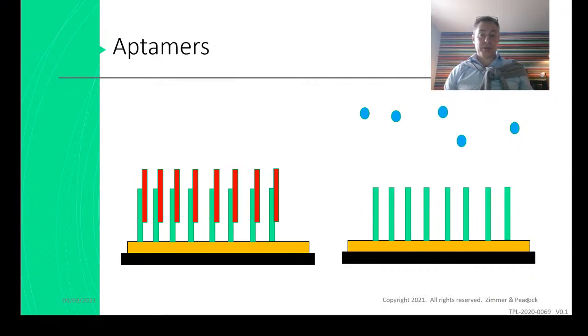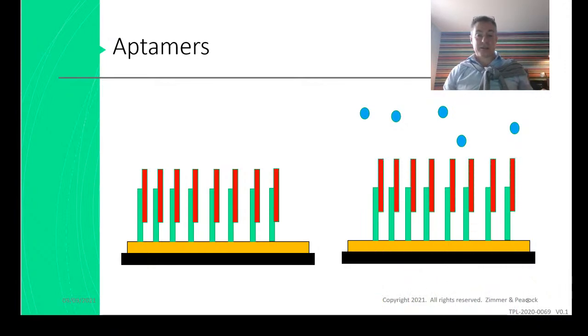What he should do is put something like ferrocyanide into his buffer and put a poised potential of something like 200 millivolts, so that he's got something active going on. There is an electron transfer, and then when he binds, he will impede that electron transfer. So first of all, Phil, as I think Ali sometimes says, there's not quite enough details. We're speculating, but the whole point of this webinar, sometimes in answering your questions, is to educate and help others and help ourselves as well. So my suggestion is this: Ali's right. You have to optimize it, and that is something that somebody can't do for you.